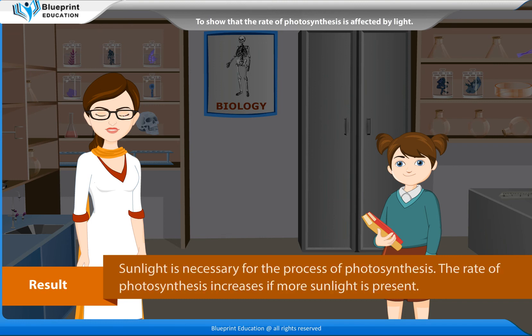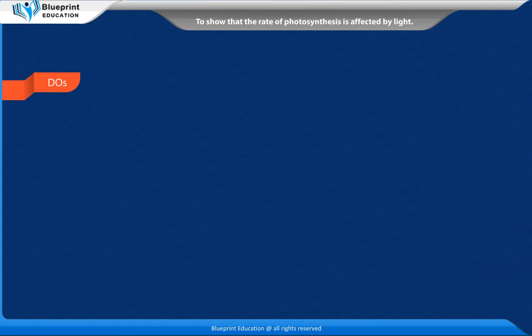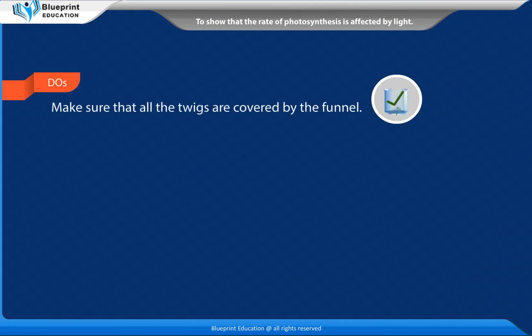Result: Sunlight is necessary for the process of photosynthesis. The rate of photosynthesis increases if more sunlight is present. Do's: Make sure that all the twigs are covered by the funnel.